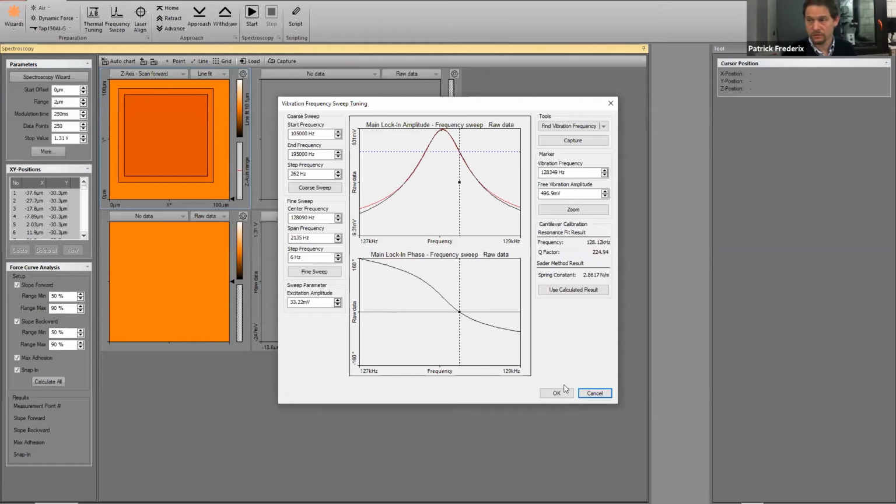If you look at adhesion force, you can get the work that needs to be done to pull a cantilever away from the surface, or the maximal force needed for that. If you look at polymers, you can do, for example, a worm-like chain fit and calculate the chain length. You can calculate the rupture forces, or persistence length if you have sufficient data. So that's the kind of data you can get out of the spectroscopy data.